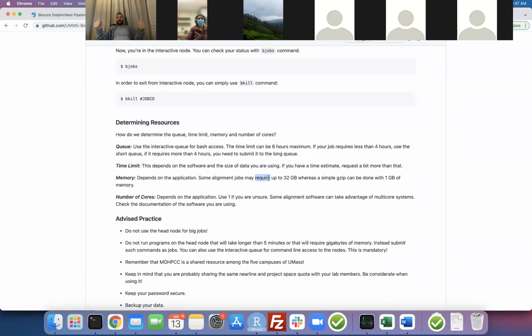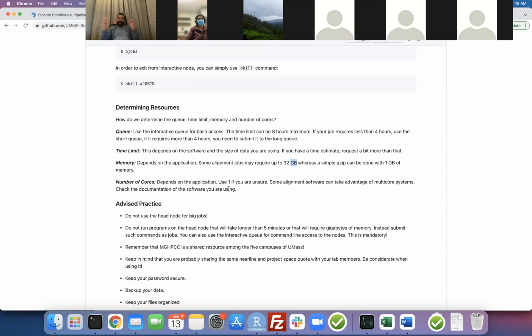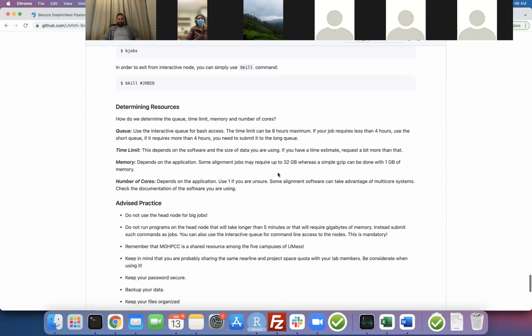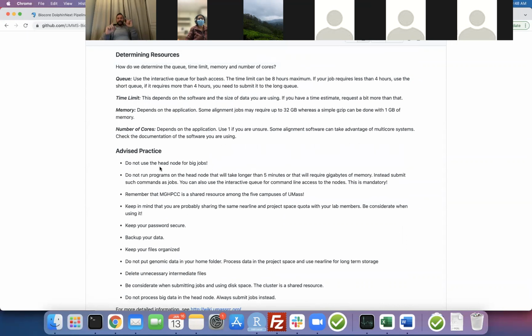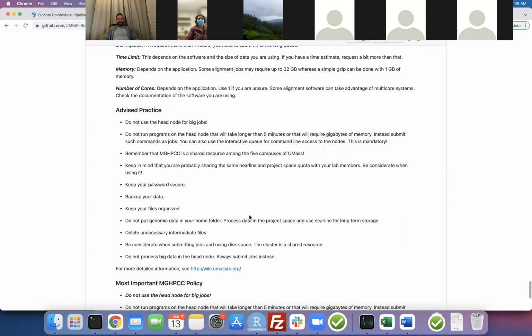Or you have 10 million reads, but you're using a smaller genome. Maybe you're using Escherichia coli or something like that, and it's much smaller. Then when you map that, it's going to use only kilobytes or maybe megabytes of memory. It's very little, so you don't need 32. If you're using human, it's going to use this much memory. If you are using bacteria, it's a totally different world. Even when you have 10 million reads, it's not going to use that much memory. But you learn this by looking at the bjobs -l command. You're going to learn those kinds of things.